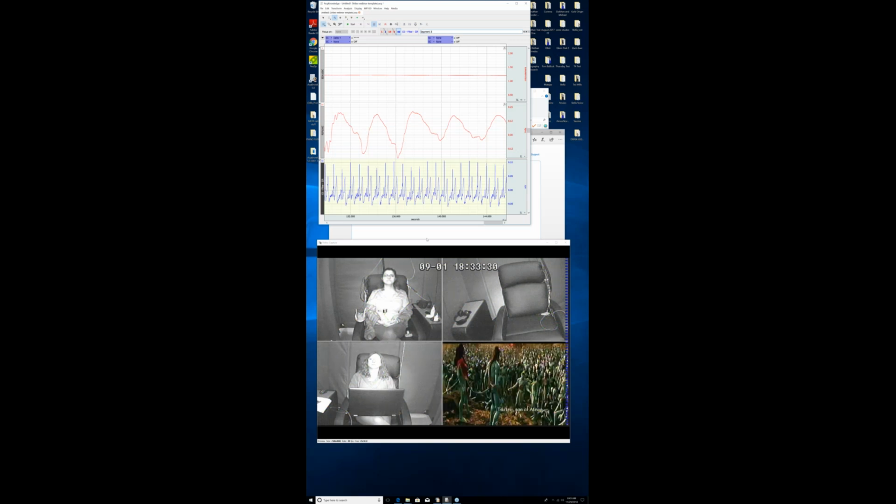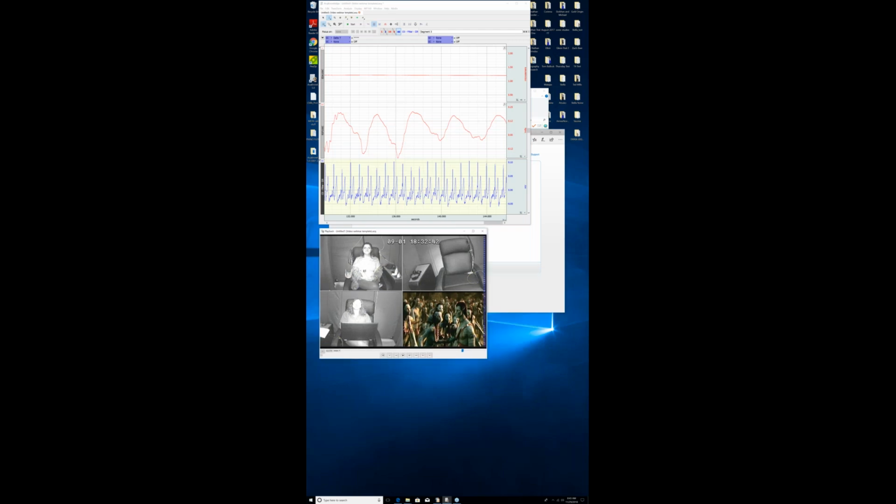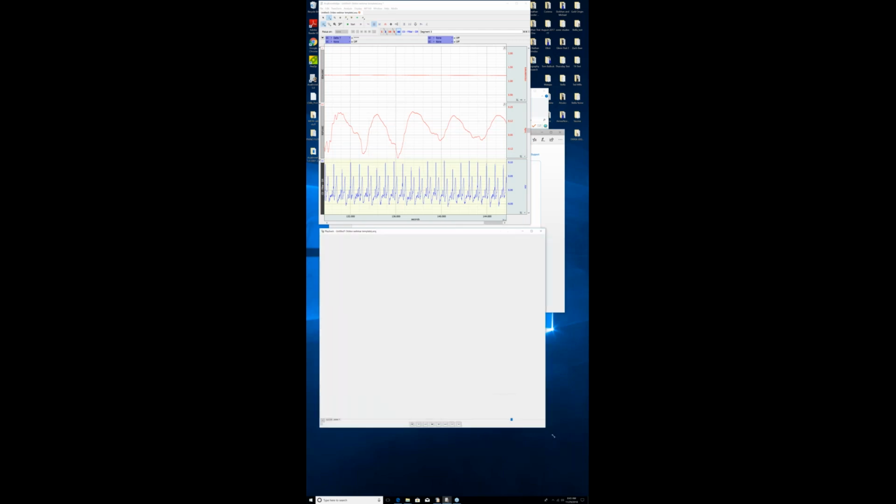So what I'm going to do now is open up the playback and bring the playback. Turn this off. Go to my second monitor. And there we go. So this is the video that we just recorded.